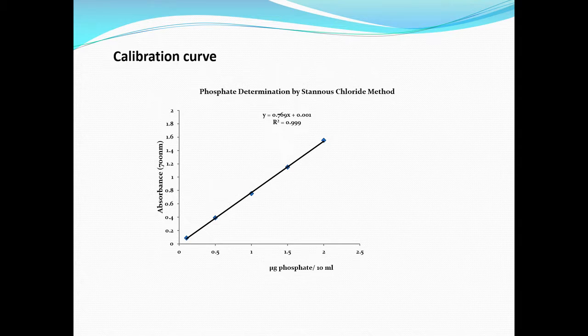So, you may note that nickel does not interfere, and usually in 100-fold range cobalt, nickel, copper. Copper does not give any color, there is definitely some amount of interference, and zinc gives interference, molybdenum, all these things interfere.